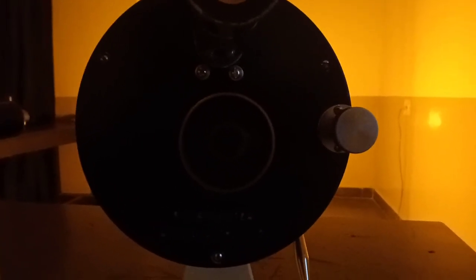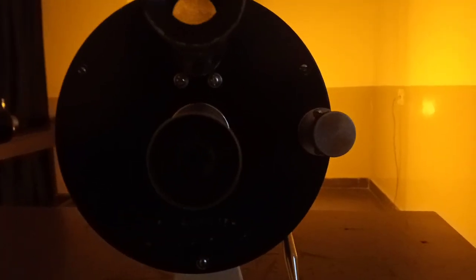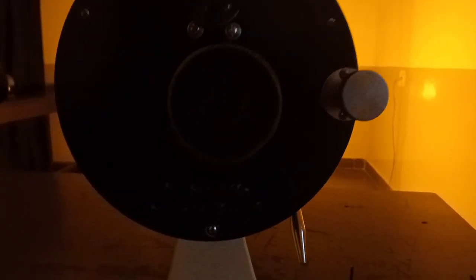So when you're taking the reading for the distilled water, which is the reference reading, I can't really show it here, but when you look through the eyepiece, you can either see both sides equally bright or both sides equally dark, or one side dark and one side light. As you rotate the second Nichols prism, the intensity of one side will keep changing with respect to the other.